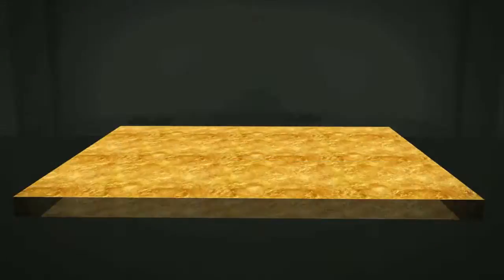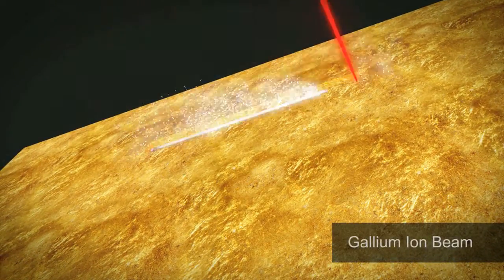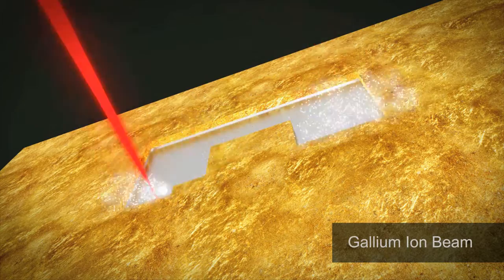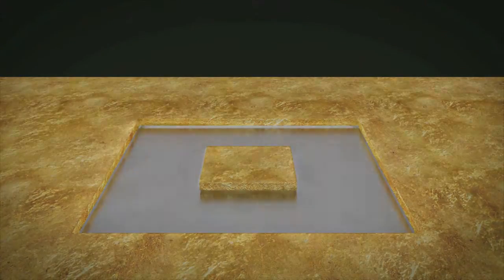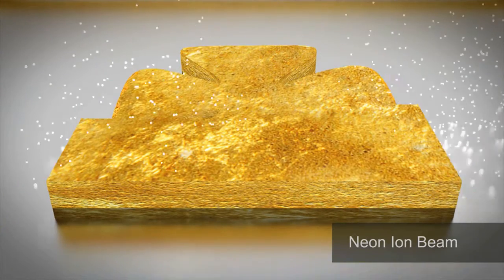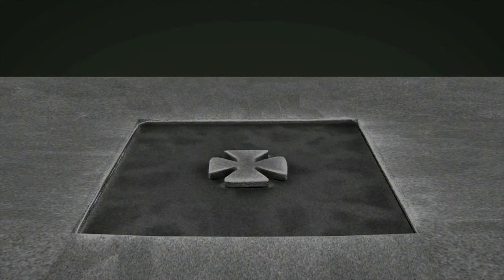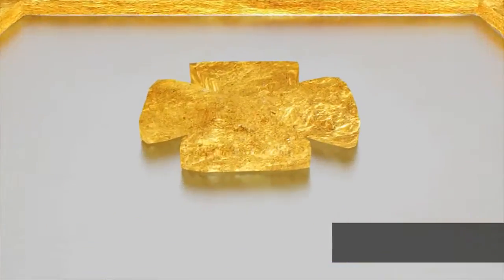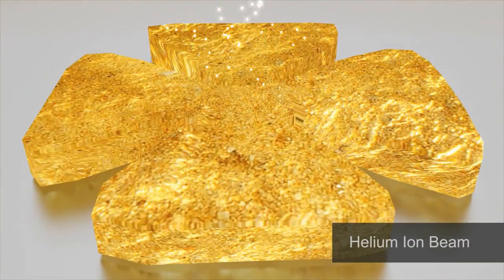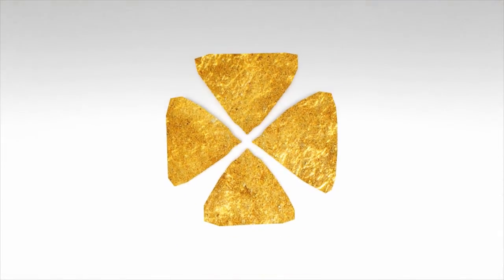Orion NanoFab unites three ion beams in one system. Use optional gallium FIB to remove massive material. Take advantage of the powerful yet gentle neon beam for precision nanomachining with speed. Use the helium beam to fabricate delicate sub 10 nanometer structures that demand extremely high machining fidelity.